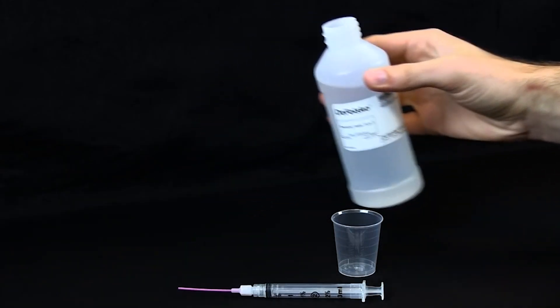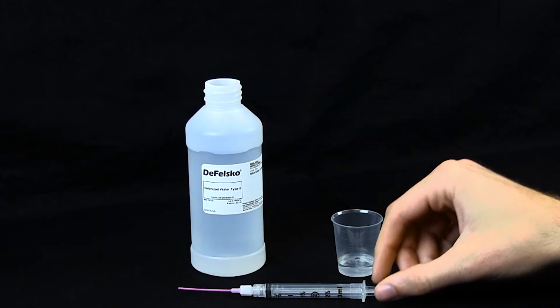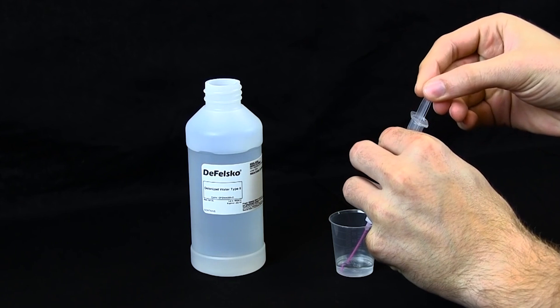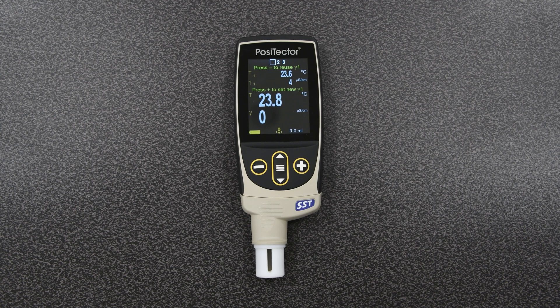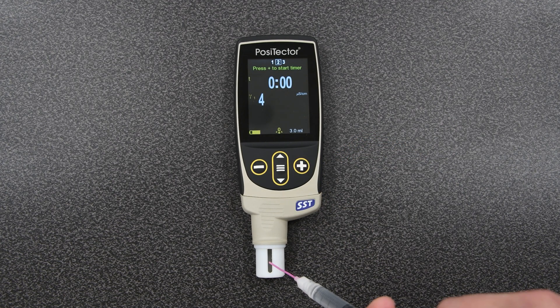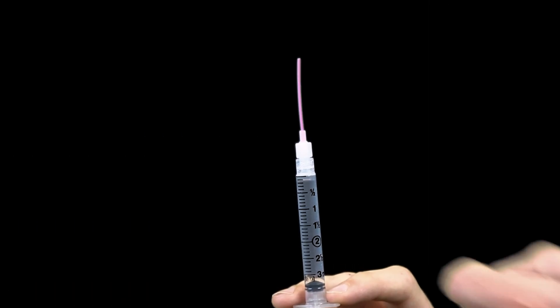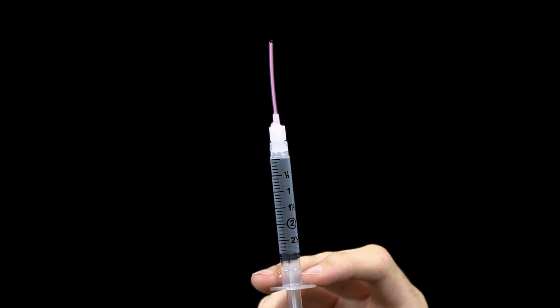To perform a Bresle Method test, first pour at least four milliliters of deionized water into a clean cup to prevent contamination of the water source. Fill the syringe with deionized water from the cup. The PosiTector SST automatically displays the previous background measurement. Press the minus button to use it, or to take a new one, fill the test cell, and once stabilized, press the plus button to save the new background measurement. Draw water back into the syringe, removing all of the solution from the test cell. Invert the syringe and expel the air and excess solution until there are three milliliters of solution remaining in the syringe.